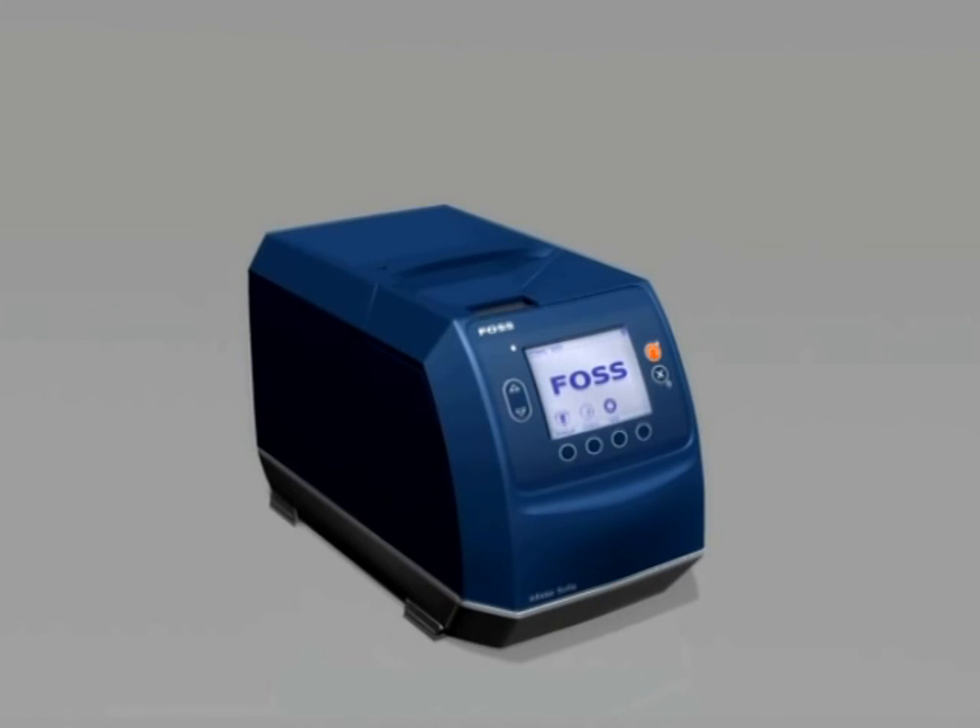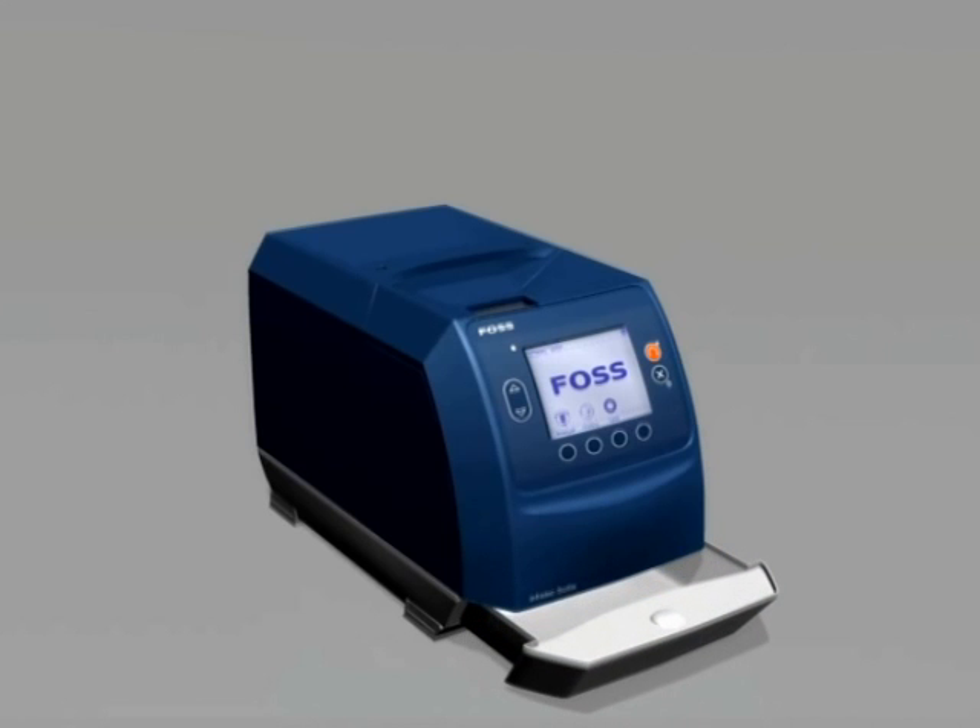Before the blue instrument hood can be lifted, the drawer must be opened as the drawer locks the blue hood in place. Once the drawer is pulled out, pull up the bottom edge of the hood and it will lift up.